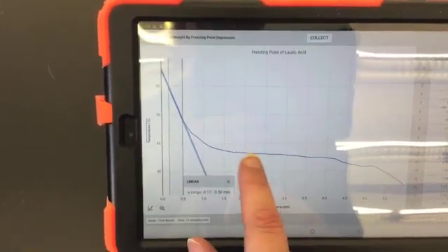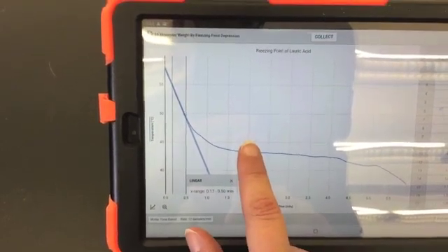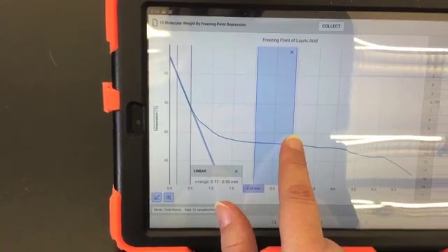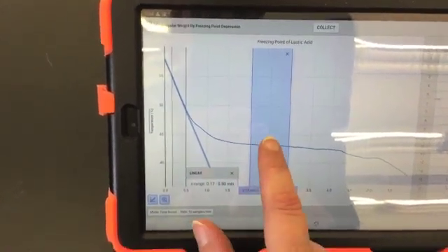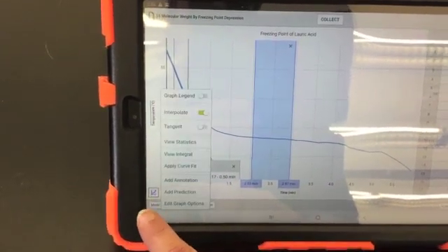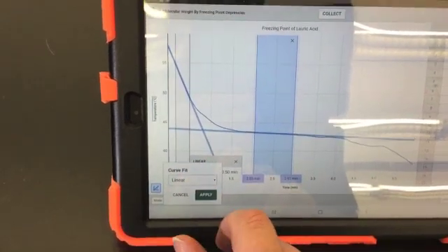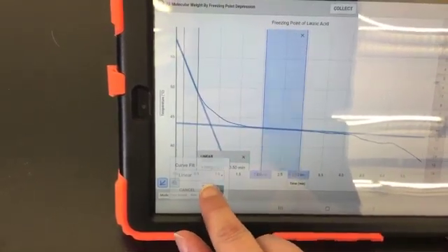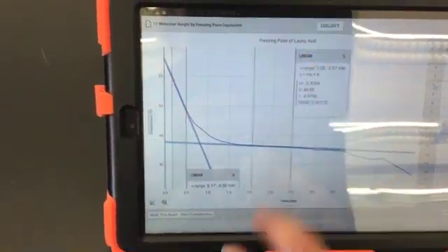Now I need to highlight the region of the graph where the slope is the lowest and closest to zero — that is the flattest region of the graph. I'm going to do the same thing here, clicking on the corner, adding a curve fit, applying it, and then moving the box out of the way.